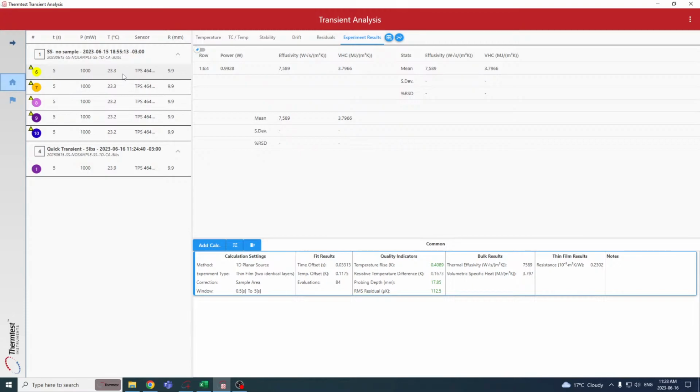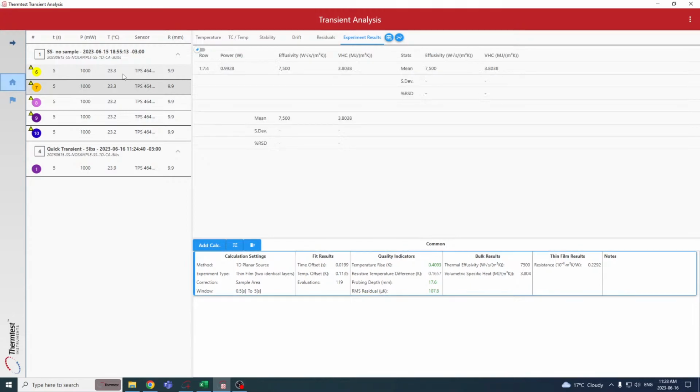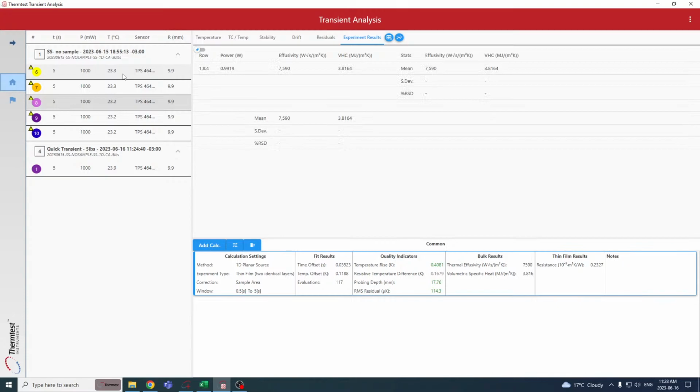You can see the repeatability as I toggle through one measurement through the 5. So 0.23, 0.229. We'll just show the rest of these so you can get an idea of the repeatability of that setup. If you export these all to Excel, this is all summarized, all the properties. We just try not to put too much data all in one place, and Excel is a nice way to review that.